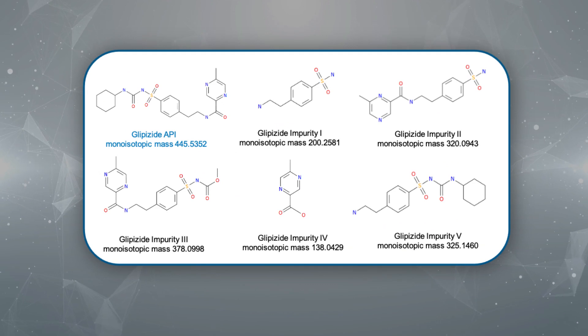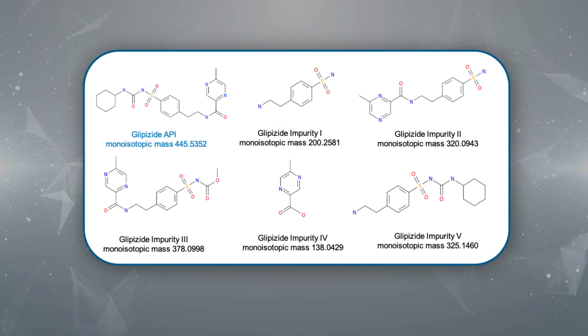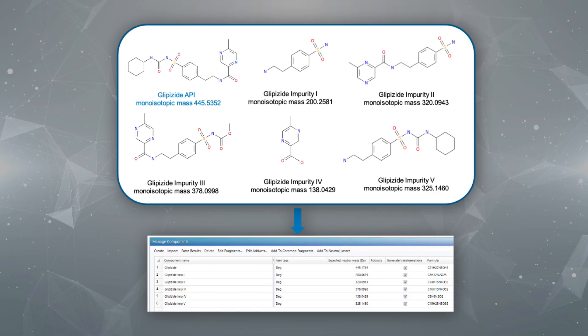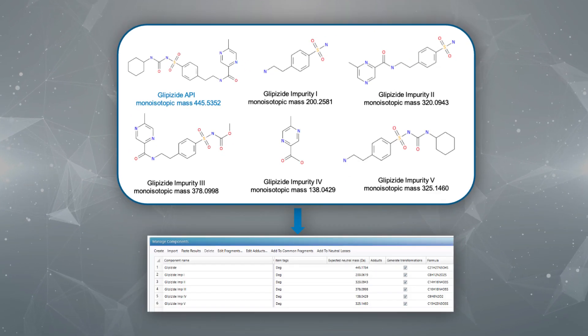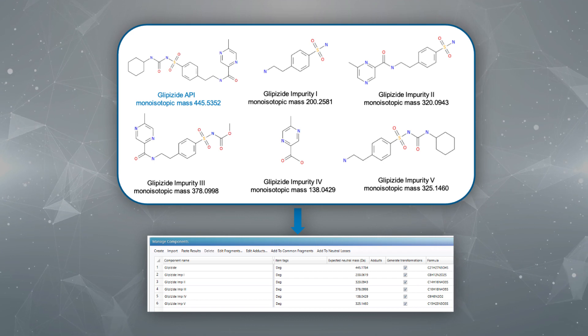As an example, a targeted workflow has been set up to assess the degradation of the anti-diabetic drug glipizide under acidic, basic and oxidative conditions. Using the processing method within UniFi, we have imported mol files of the glipizide parent drug and five known impurities. UniFi will use this information to interrogate the data generated and intelligently assign identified compounds and fragments.